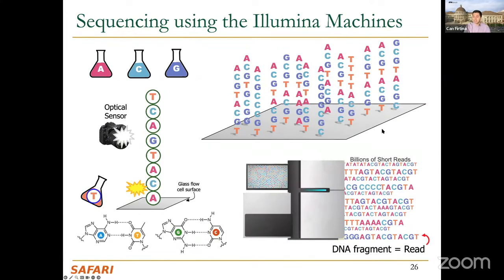Because we're taking the picture, we want to see the same color every time at different places. But in practice, this is not the case, and some reads go out of sync, meaning that on the surface we may have different bases, just because this particular read is going out of sync across cycles.